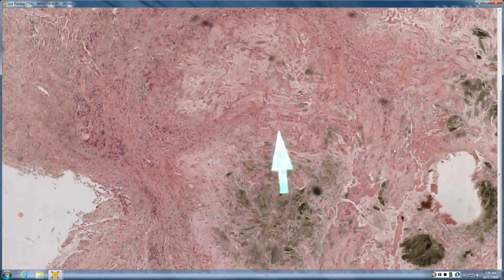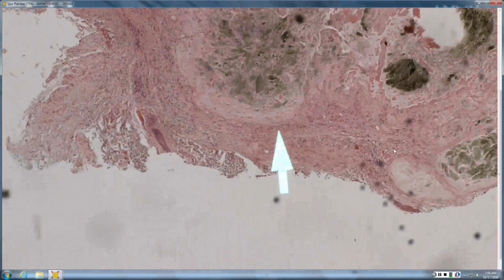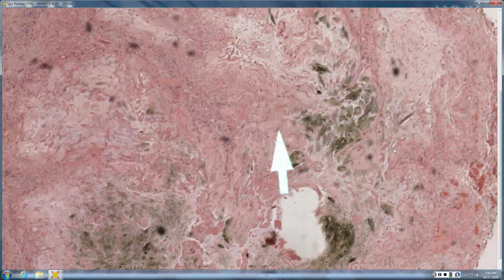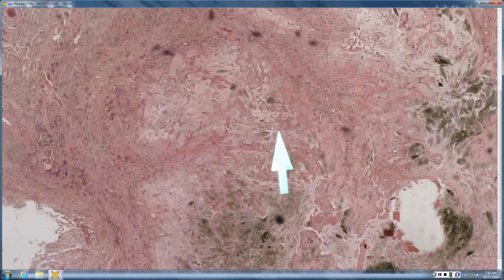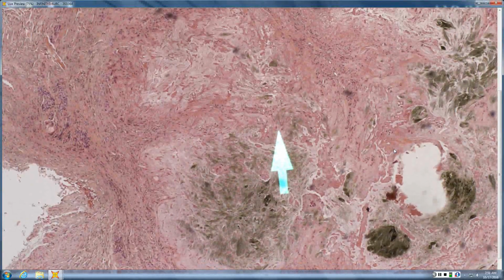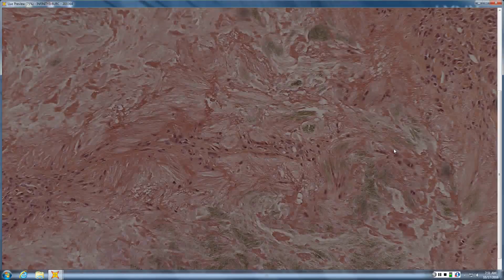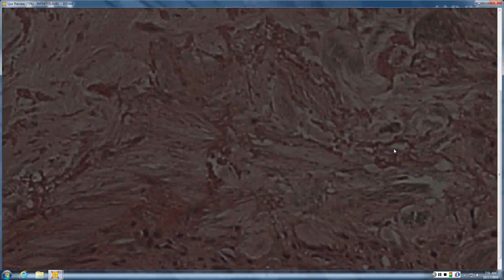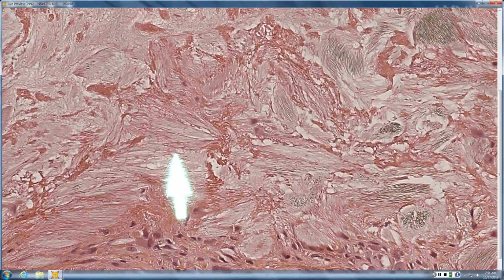So we had a dermal nodule. And you're in upper year, so it doesn't have to be a chapter we've covered so far. My first thought was something from a metabolic chapter, like gout or oxalosis. Do these crystals look more feathery like gout, or more of a four-leaf clover pattern? The latter.